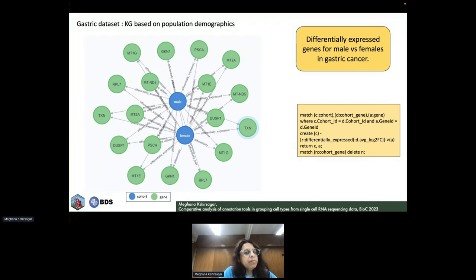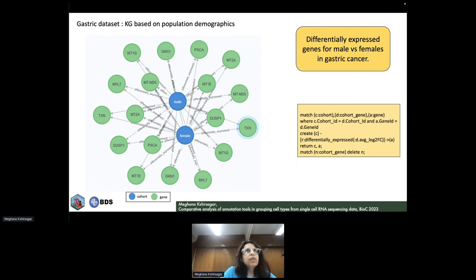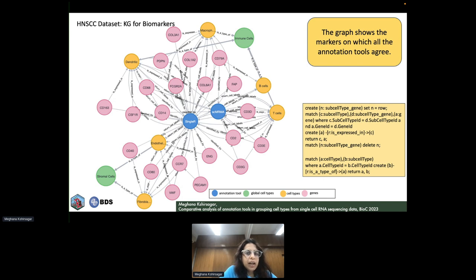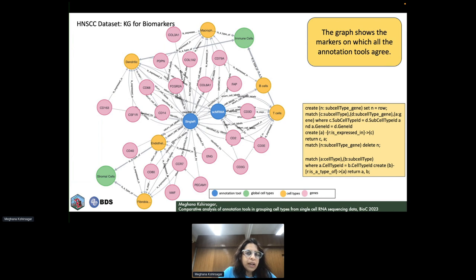The next insight extracted was for the prompt: 'Find the differentially expressed genes in males versus females,' with filters based on log fold change and p-value. For head and neck squamous cell carcinoma, we extracted insights on biomarkers agreed upon by both SingleR and scMRMA annotation tools—combinations of genes agreed upon between both tools. Global cell types appear as green nodes and subtypes as orange nodes.